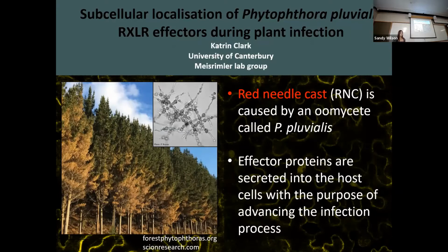The aim of my project has been to use fluorescence microscopy to visualize and record the localization of these Phytophthora pluvialis RXLR effectors.